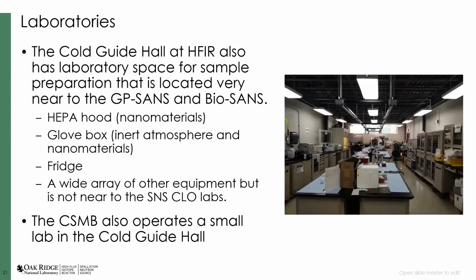Similarly, at the HFIR, there are some very nice laboratory spaces available for users to work with their materials. Again, it is a fully outfitted laboratory, and you can request access to any of these laboratory spaces during the proposal process or during the confirmation of your proposal as you prepare for your experiment.